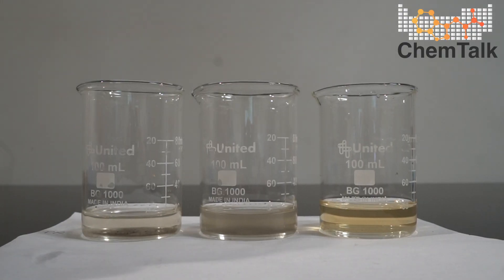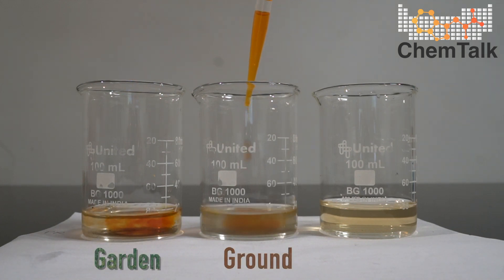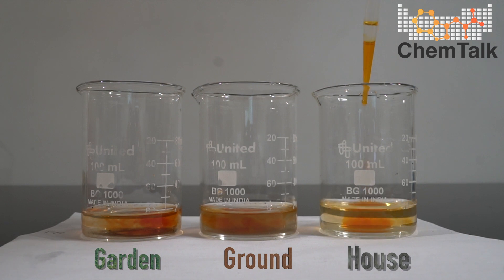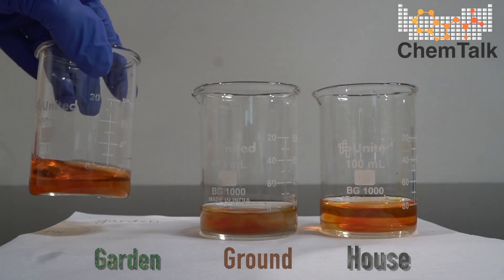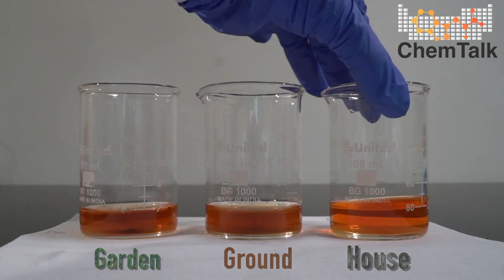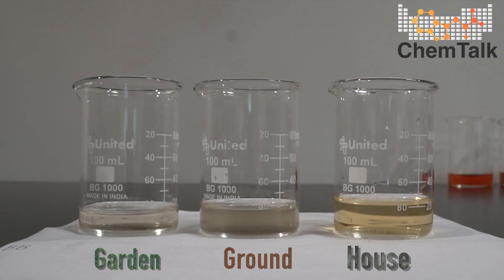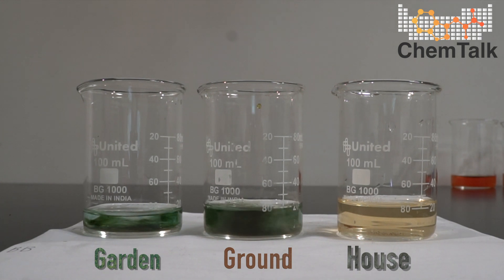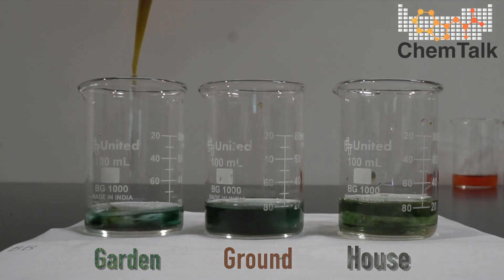All right. So first I'm adding the phenol red indicator to the garden soil, ground soil, and from my house. Shake it around a little bit. So we will let that settle for a bit. And let's move on to the bromothymol blue. All right. So now we're going to add the bromothymol blue. Garden soil, ground soil, soil from home.